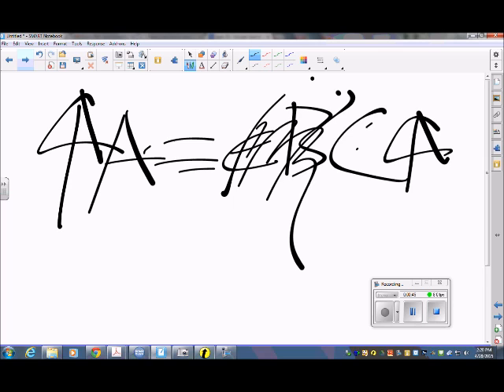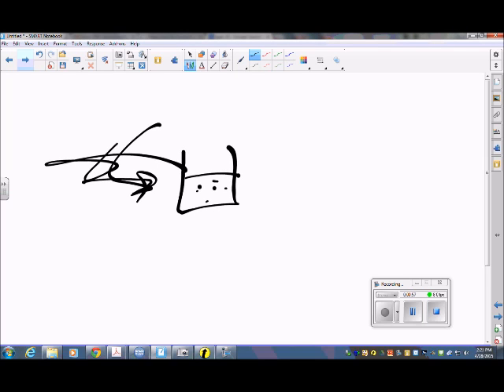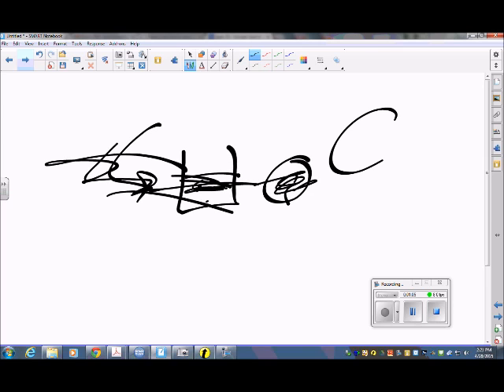So let's go to this diagram. When you have your cuvette here, fill it up with whatever you're measuring. Here's your spec, and light's going through, and some bounces off, and some goes to the sensor over here. That records our absorbance. As the concentration increases, so does the absorbance.